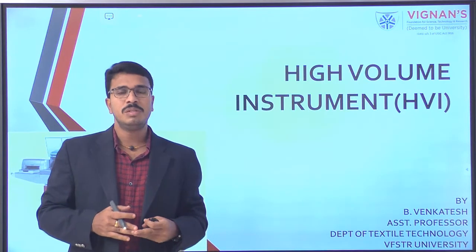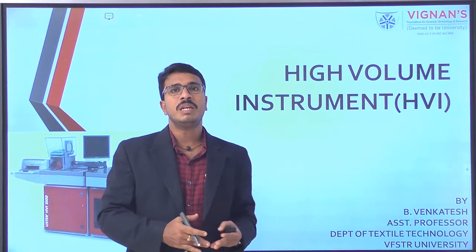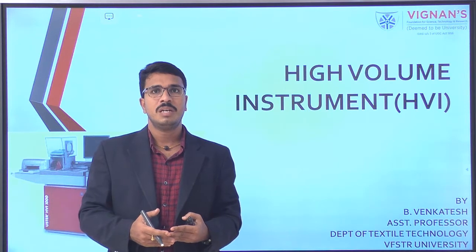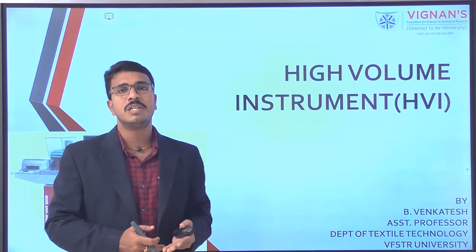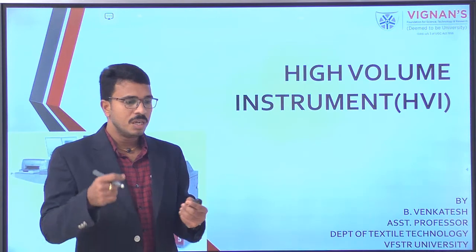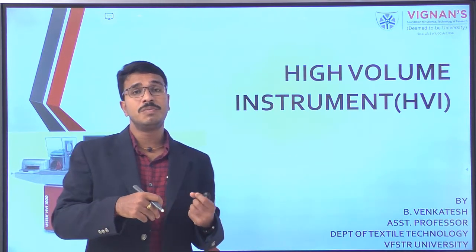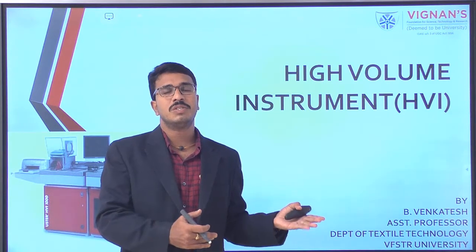In this course, we are discussing fiber dimensions, where we have seen how to measure fiber maturity and fiber strength. We have seen fiber strength measurement using the Instron tensile strength tester, which works on the strain gauge principle. Then we discussed bundle fiber strength testing by means of the stelometer, which works based on the pendulum lever principle. This is what we discussed in the last class.